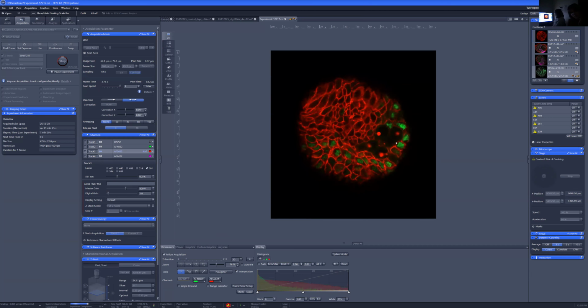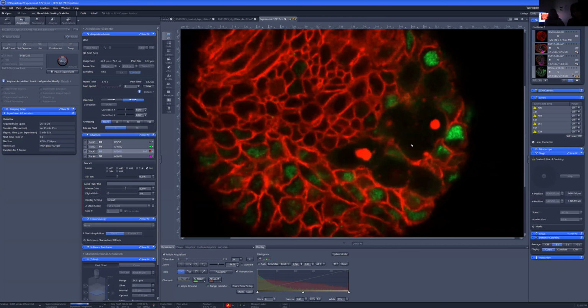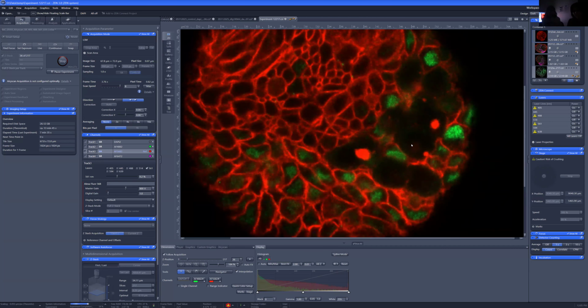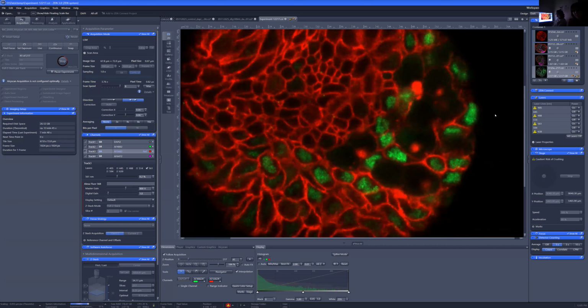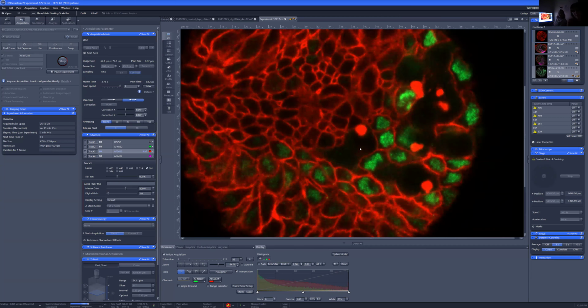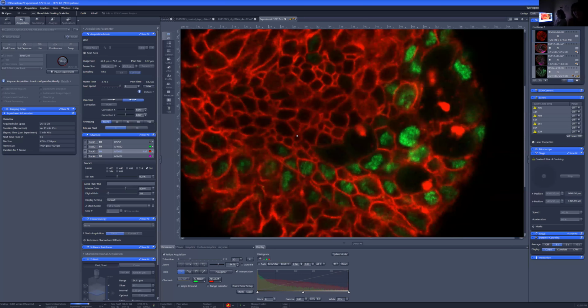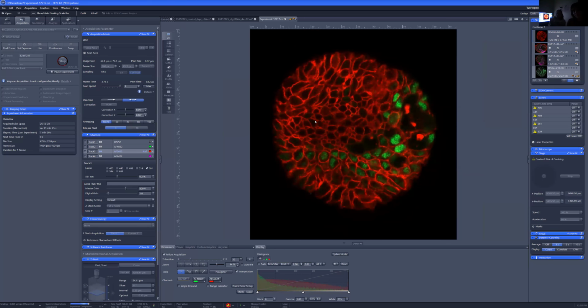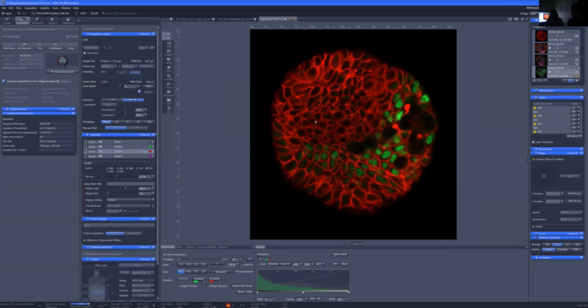And you can actually see some of these dots really nicely now, where I already know, even without my pink signal, that these cells that have the bright dots are going to be egg stem cells. And everywhere else where you just see the red signal around the membrane, those are non-stem cells. And so this image is really crisp. This one is really nice.